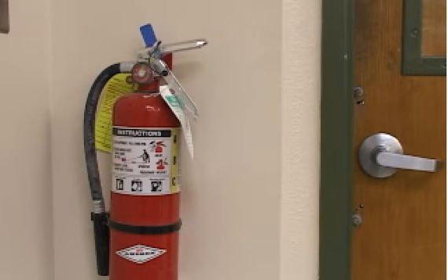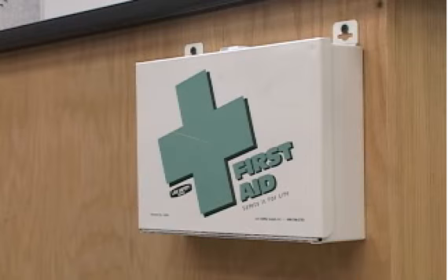Also, very important, before you leave lab is to wash your hands. Make sure you're not taking any kind of contamination with you. And the last thing on the list is the safety gear that's within the lab should you need it. There is a fire extinguisher by the door on your way out. There is a first aid kit by the teacher's desk. You'll see it marked first aid, where you can find Band-Aids or burn cream if you need it.